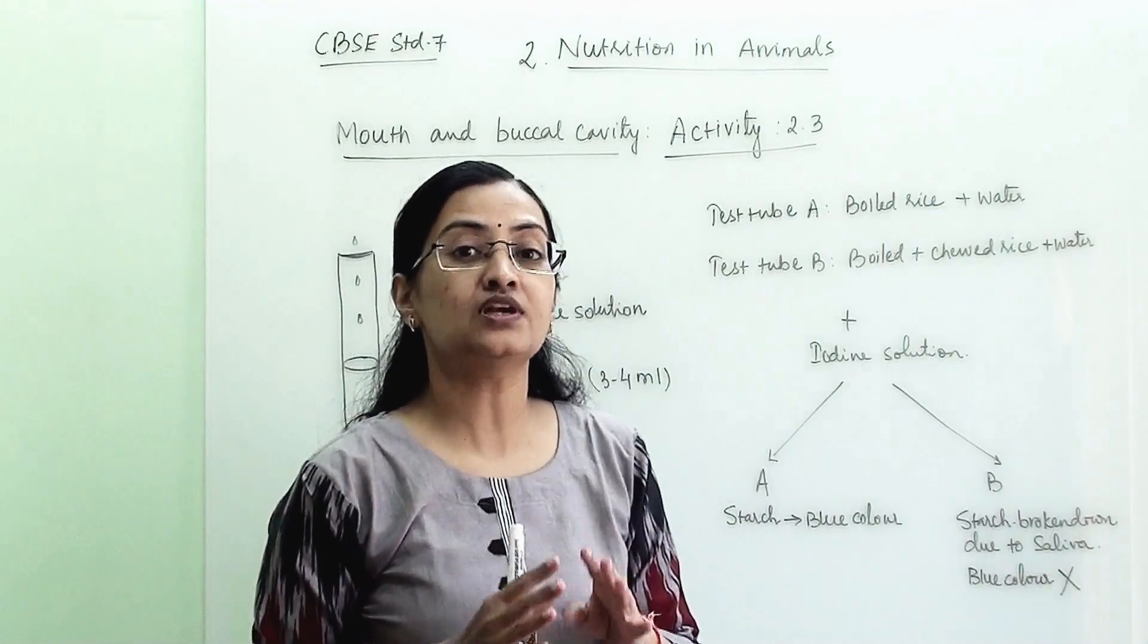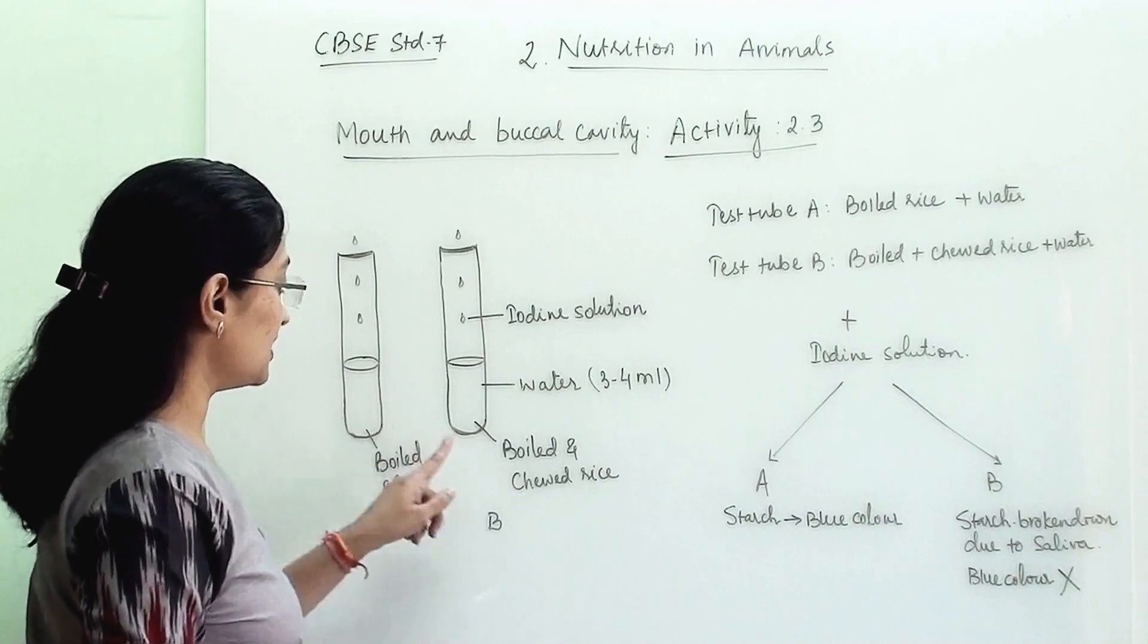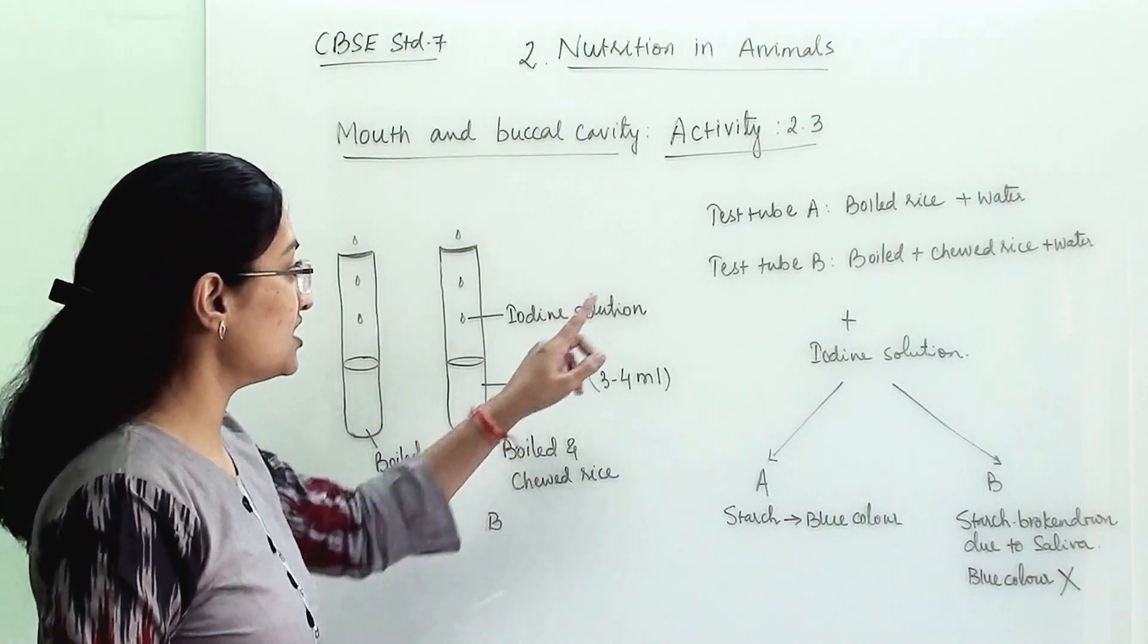So for this, we have taken two types of boiled rice into test tube. This is test tube 1, this is test tube 2.